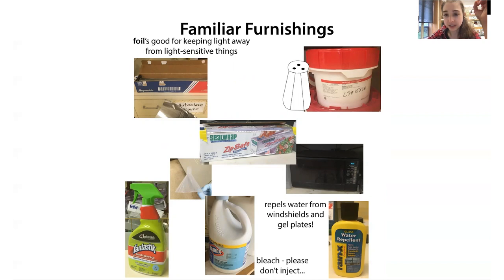We use Rainex — it's really useful when you're making big gels and you want to make sure the gel doesn't stick to the glass. You coat the glass with Rainex before pouring the gel so it comes off cleanly without ripping. We also have basic office equipment like a calculator. We do waste a lot in the lab because we have to, but try to reuse whatever you can and find creative ways to make storage containers. So that's some stuff you'll find in a biochemistry lab — now go enjoy!